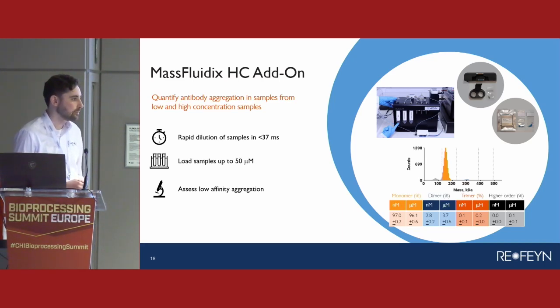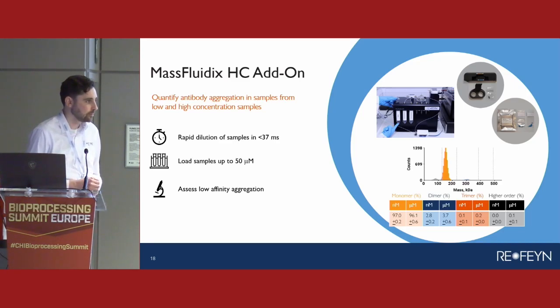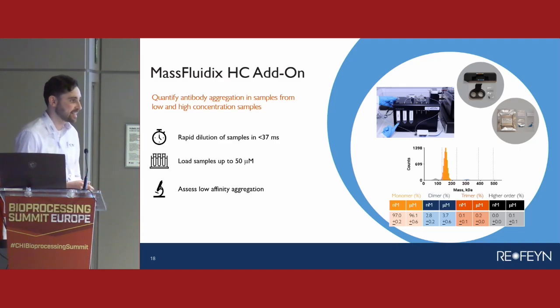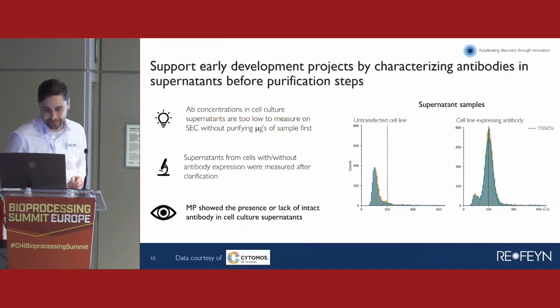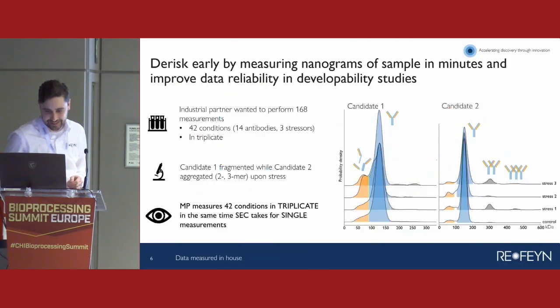In the beginning, you mentioned something about the principle of the instrument. How different is it from DLS? Because I remember there's some resemblance, but with DLS you can measure the size but not the mass. Yeah. So it's very different to DLS in many respects. I used to work on DLS when I first started in this industry.